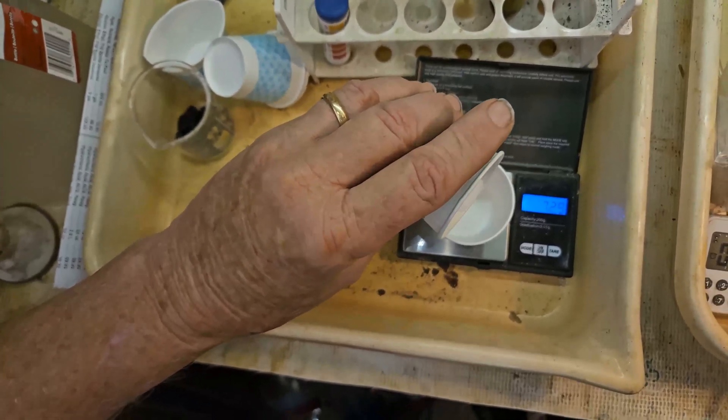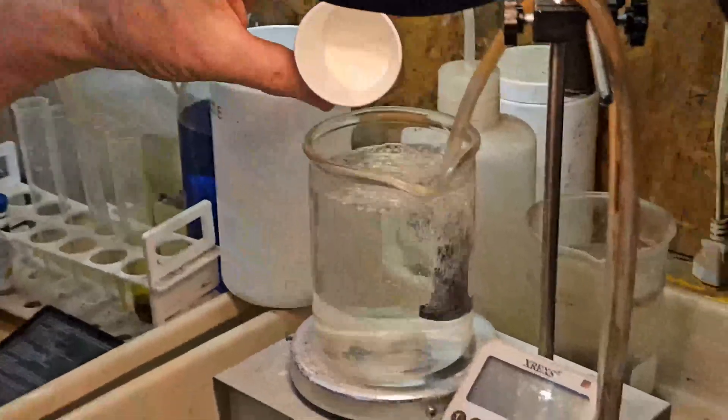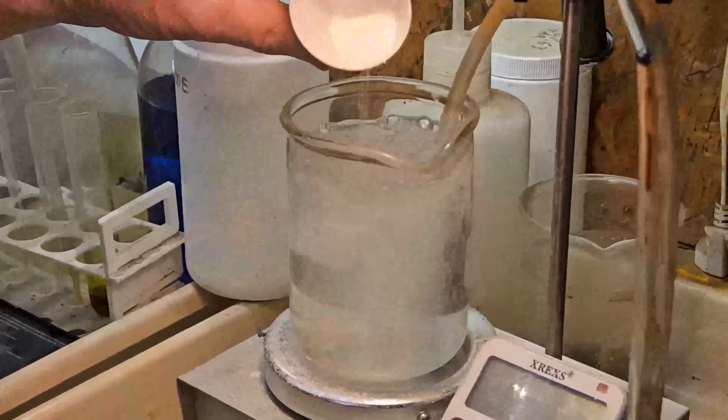Sodium percarbonate makes hydrogen peroxide, which produces free oxygen. We add the sodium percarbonate — the white gas you see is the oxygen being released.